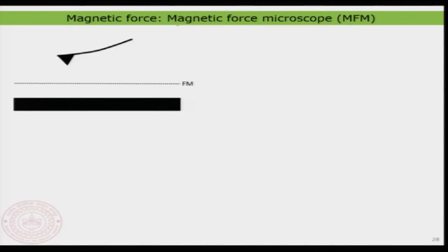Now, what I want to do is switch the topic slightly and show you magnetic force microscopy. In magnetic force microscopy, what we want to resolve is the magnetic contrast.